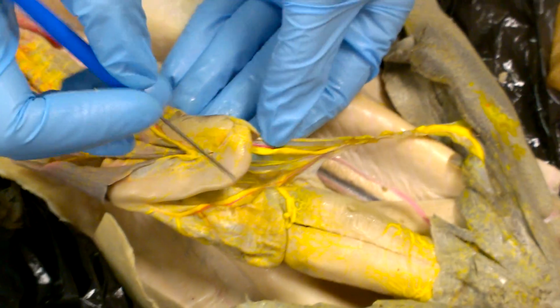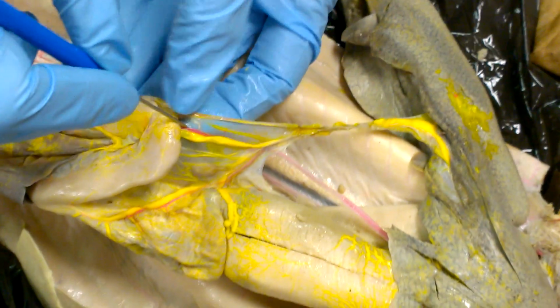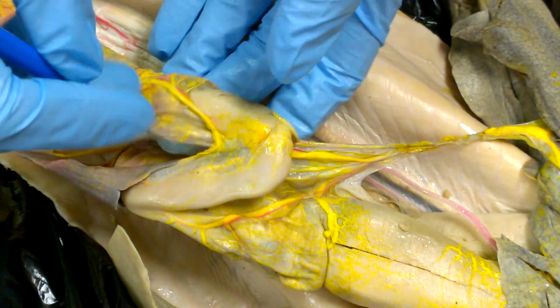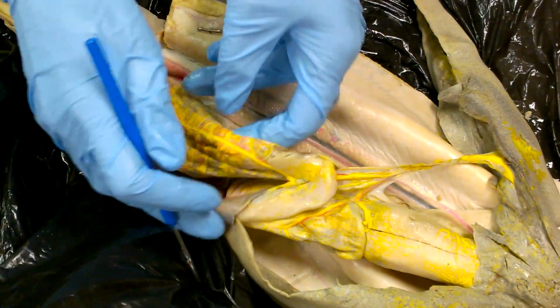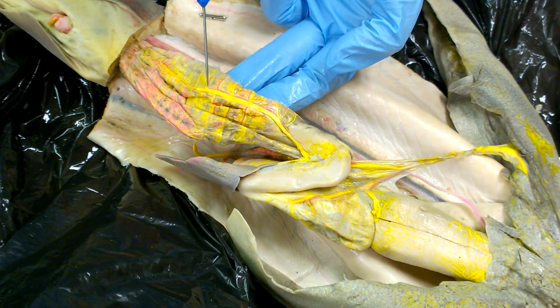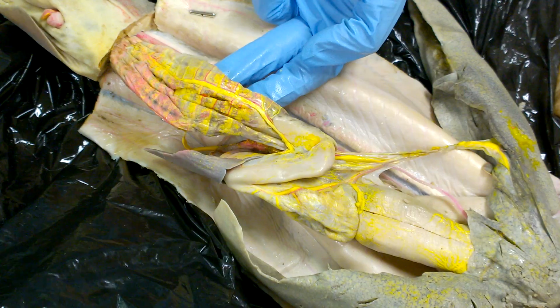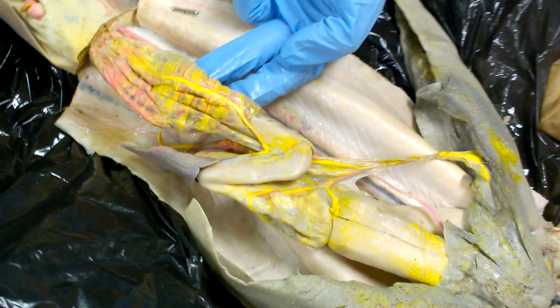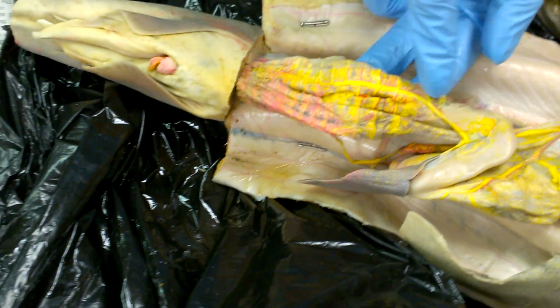Okay, so then we're going to pick back up with the pancreatico-mesenteric artery. It's going to come under here, and it branches into lots of branches, but the only one that we can see is this one here. The something intestinal. Right, what part of the intestine is it taking blood to? The posterior. Really? Anterior. Yes, because see, it's just this front part.